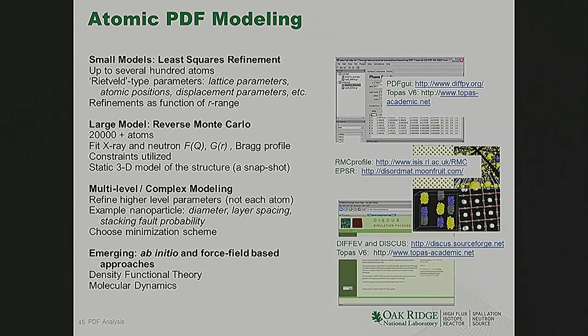And then I showed you one example of MD compared to experimental PDFs. That's definitely still an emerging area. I would say it's becoming more and more popular. You can always give your PDF to your favorite theorist and see what they can do with it.